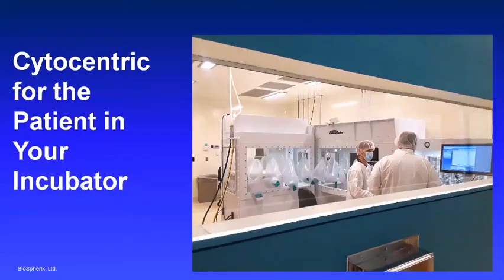It's critical to take this point of view and change it from a people-centric point of view to a cytocentric point of view. Make the conditions about your cells from start to finish in whatever cell assay or cell process that you have to do for the good of the patient in your incubator.